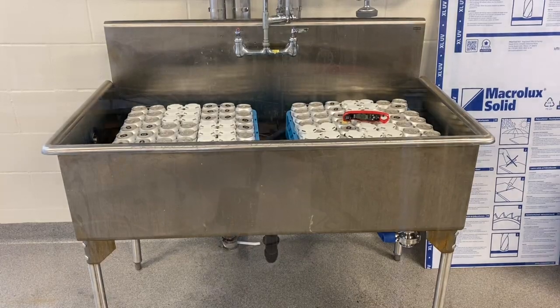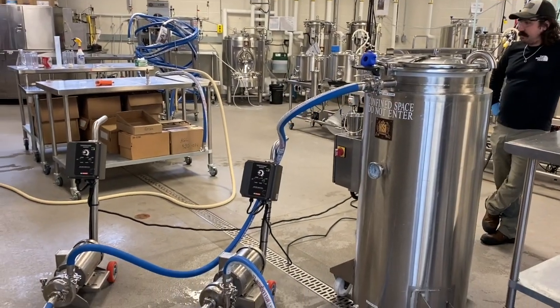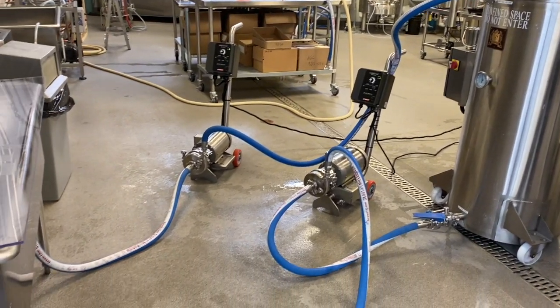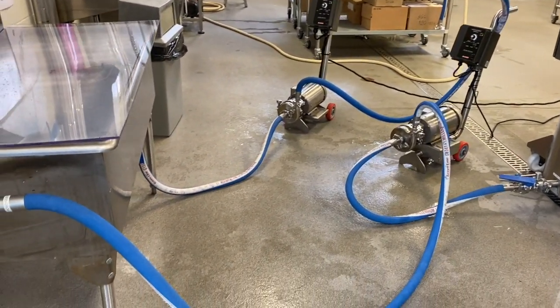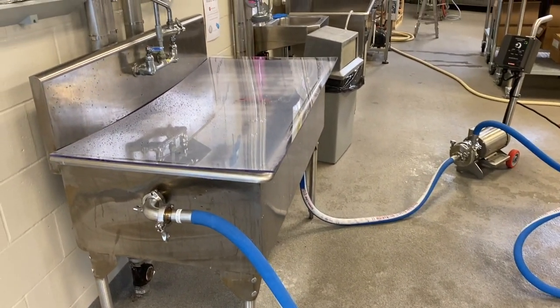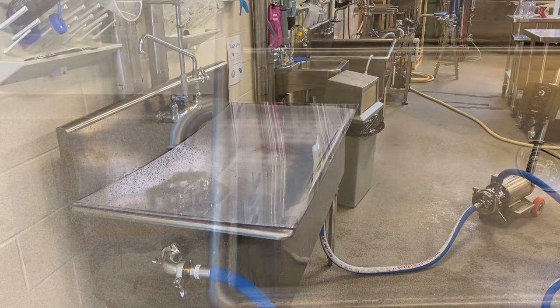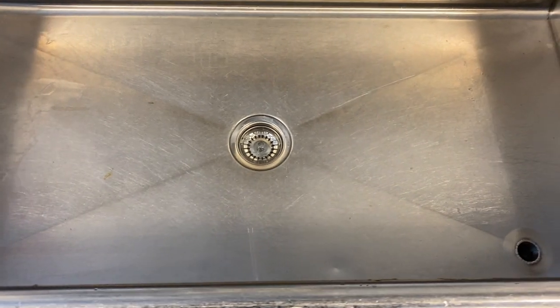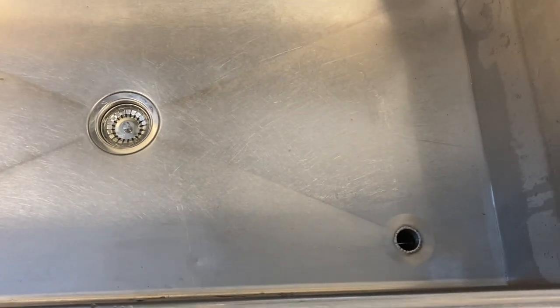This improvised batch pasteurization setup consists of a modified lab sink, a dedicated CIP tank, two CIP pumps with hoses, a plexiglass cover for the sink, and a thermometer with an optional data recording device. This stainless steel lab sink, which can hold over 200 beer cans or bottles, has been modified and equipped with two tri-clamp fittings.